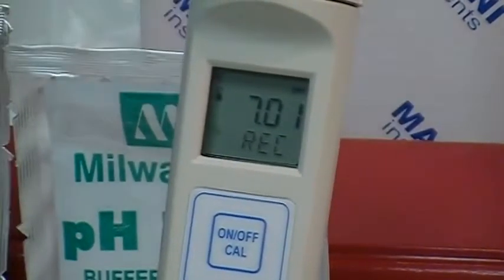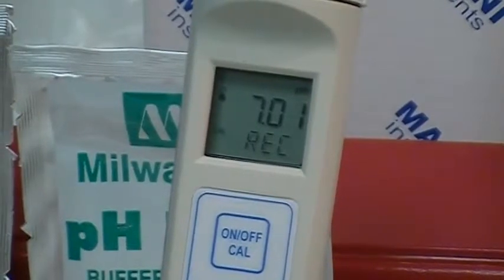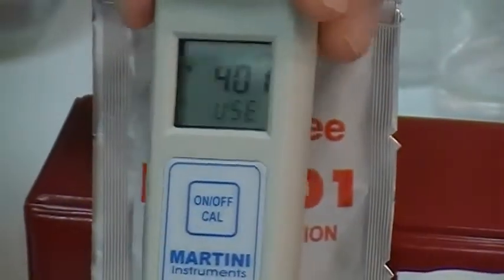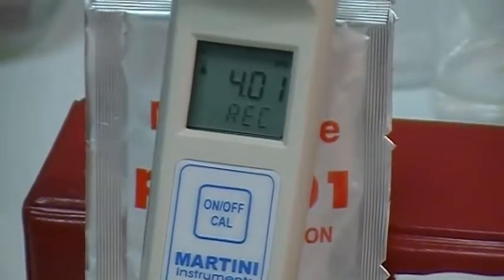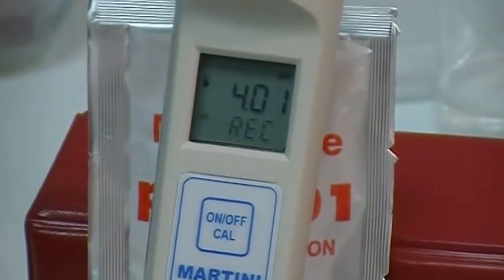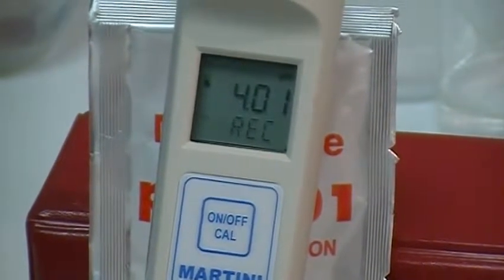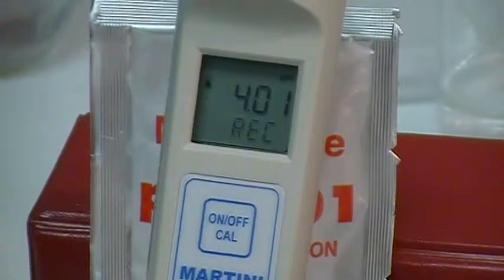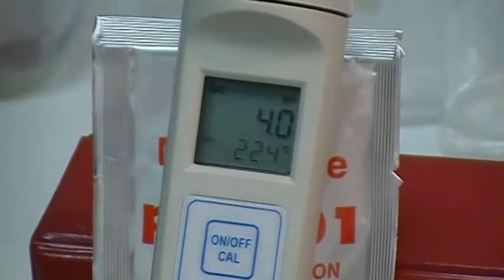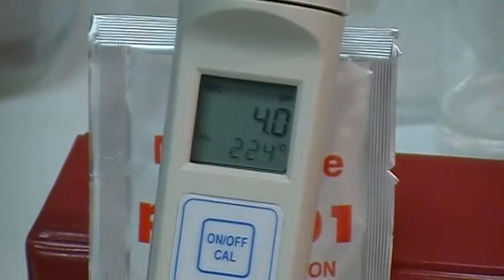Now you're seeing 'REC' for record. In just a moment it'll move to 4 — it says 'OK' on that one, asking for 4. You move it quickly over to the 4 solution, also showing 'REC'. In just a moment you'll see 'OK 2'. It takes just a moment longer for the 4. There's your 'OK 2' — now you are out of the automatic calibration procedure.